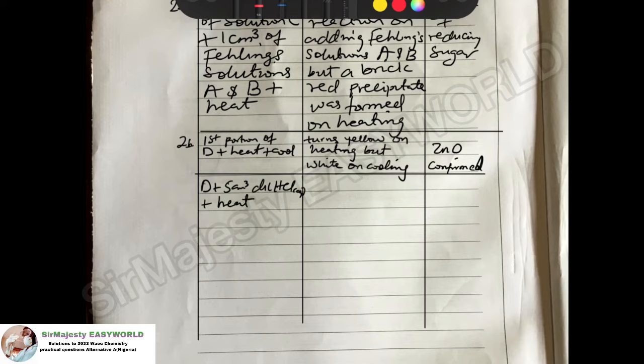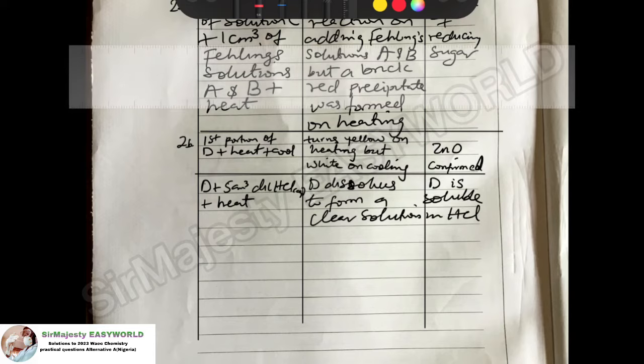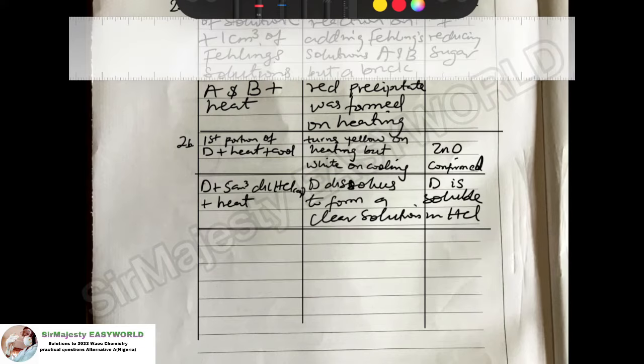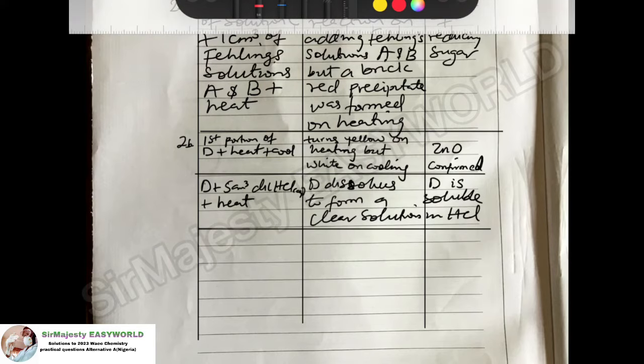They say filter if possible. Then you just say D dissolves to form a clear solution. Just because I'm teaching, D is soluble in HCl. Simple, but you are not necessarily required to give the number, because this was not numbered. They say divide this into 2. The resulting solution, we were asked to divide it into 2. That means we are going to have the first portion.